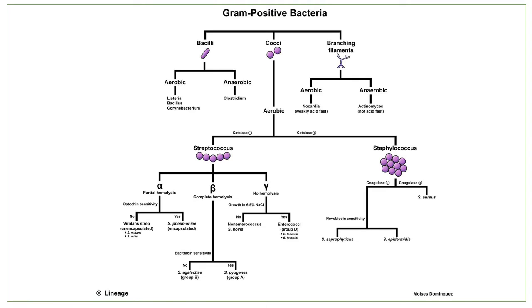Okay, so in first year you must have gone through such kinds of charts. These are charts made by the lab assistant or by the colleges to simplify your work. In first year, when you are introduced to Bergey's manual, seeing that big book, you may get confused.